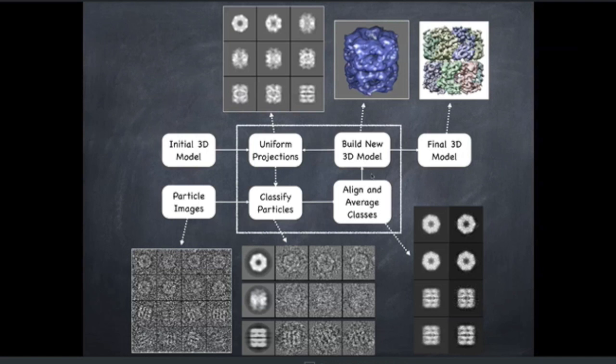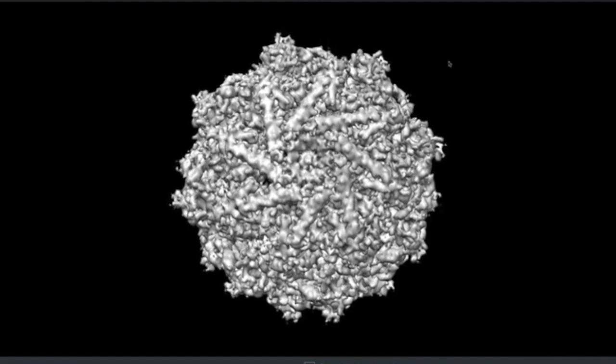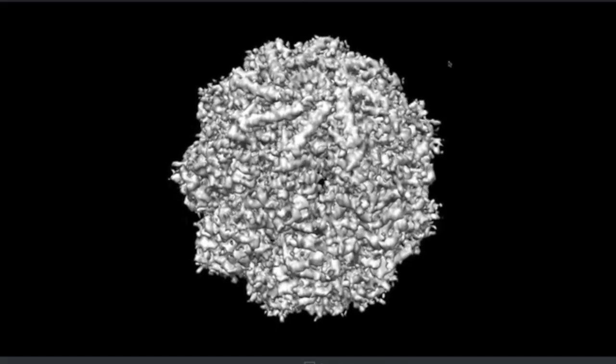So we take these particle images and we go through a processing loop, which I'm not going to get into great depth today, just in the interest of time. But the basic idea is we start out with particles, and then via an iterative process, we eventually wind up with a final reconstruction. So from those 30,000 particles, we can get something that looks sort of like this.